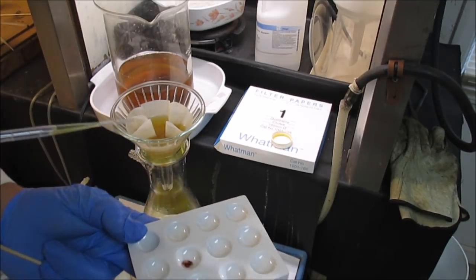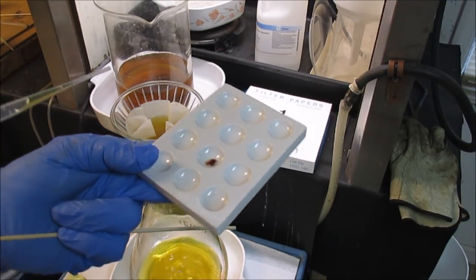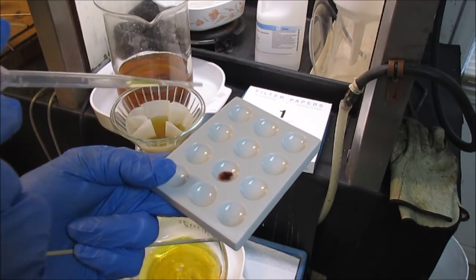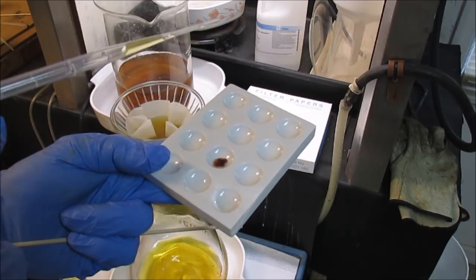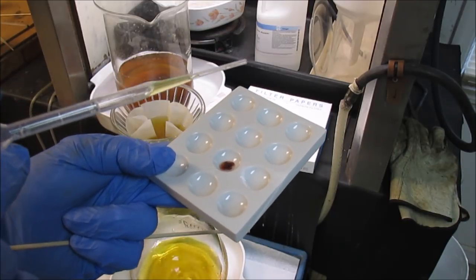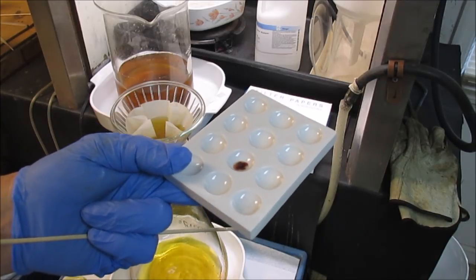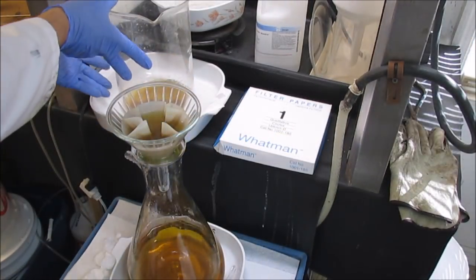See that bright red, blood red stain there? That confirms that we've got iron in solution. Iron in solution looks just like gold in solution in some cases and can be very deceiving. It's iron in solution, not gold.